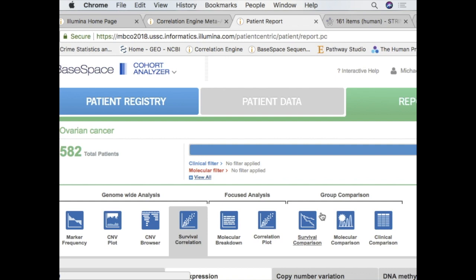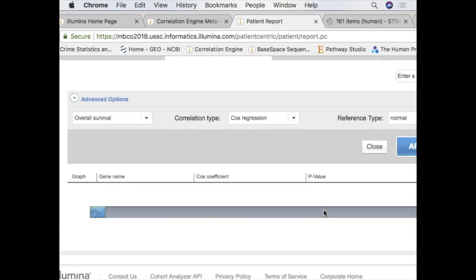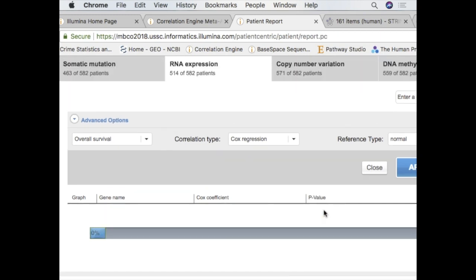All right. Did mine come up at all? It's still coming. All right. Any questions?